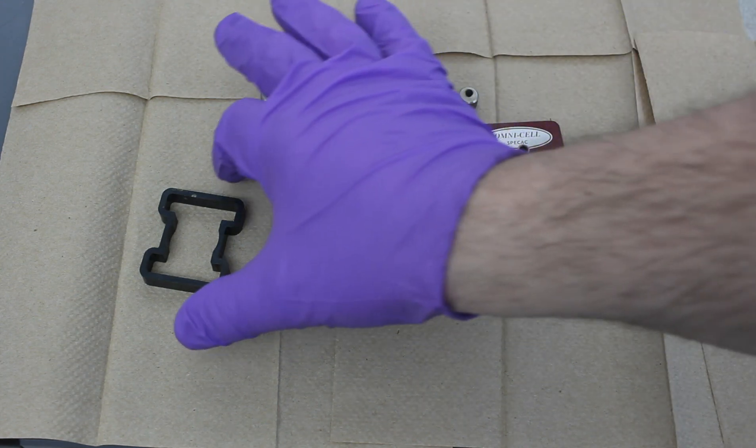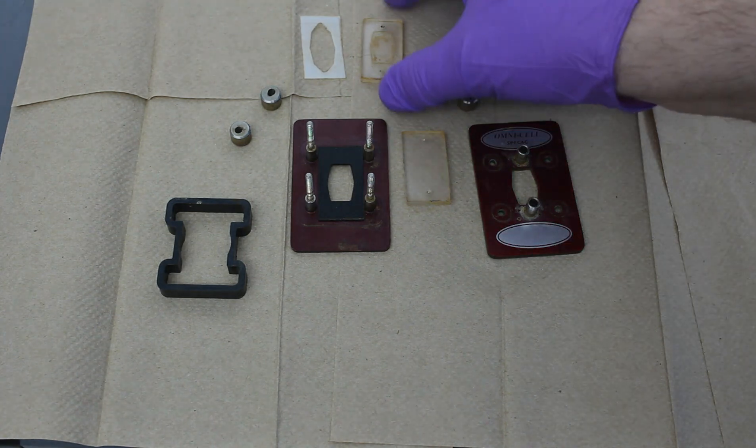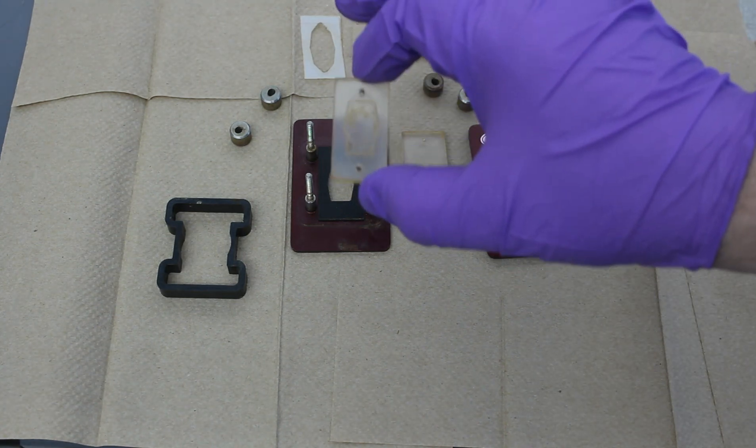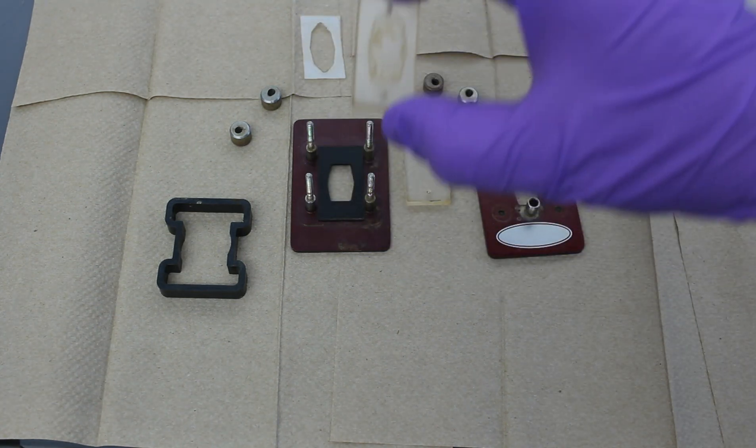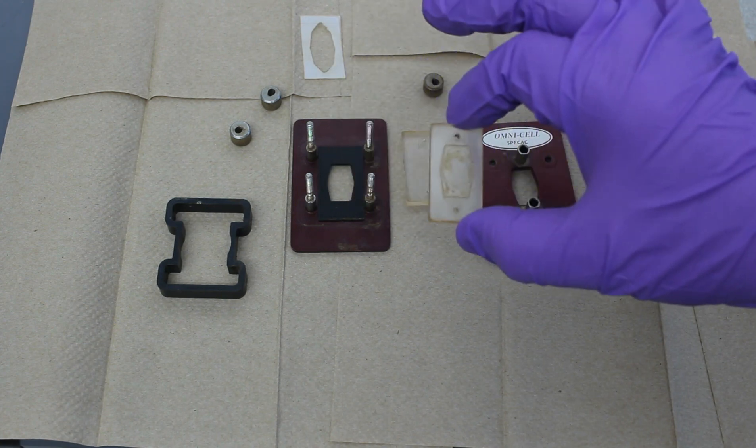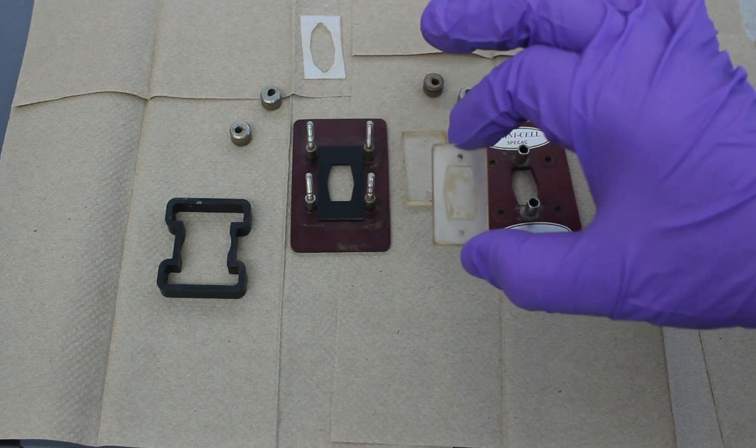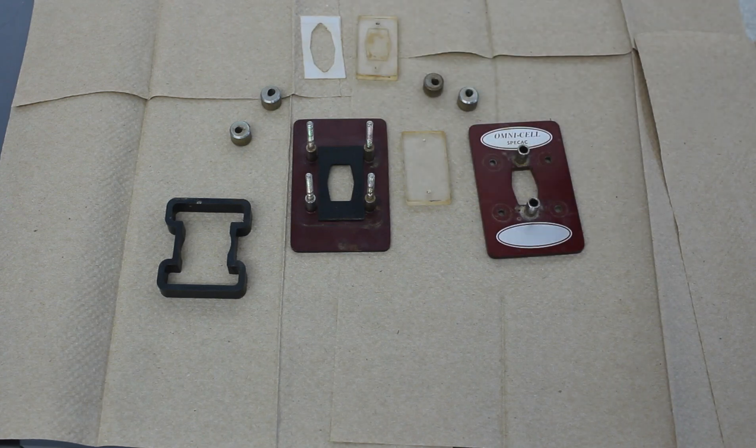So now that we've got this entirely disassembled, what you would do is very carefully wipe down the surfaces. Usually I use a little bit of acetone, maybe a drop of water to wipe away the residue, and then reassemble everything.